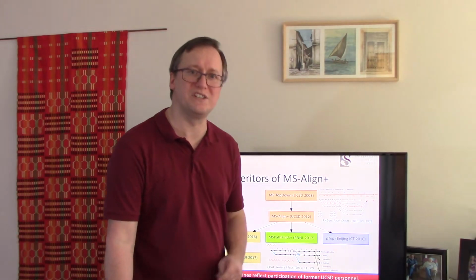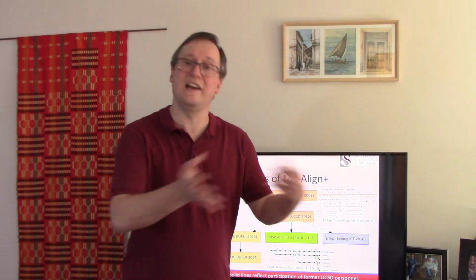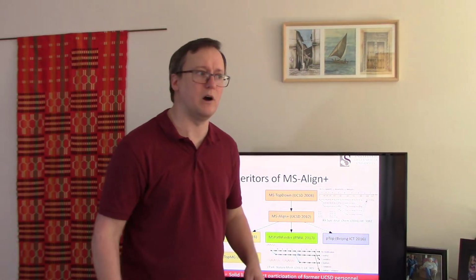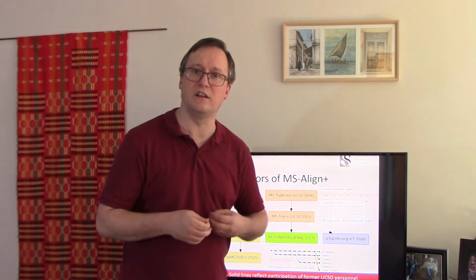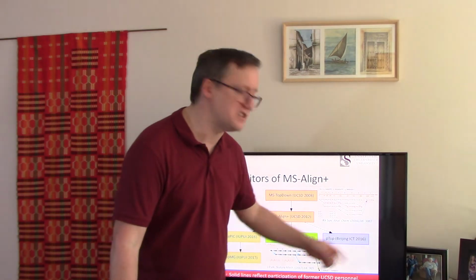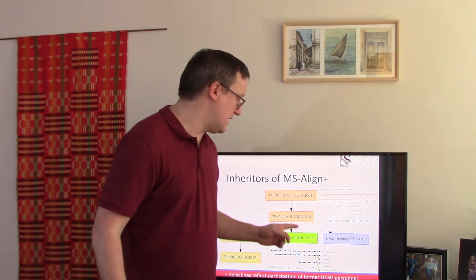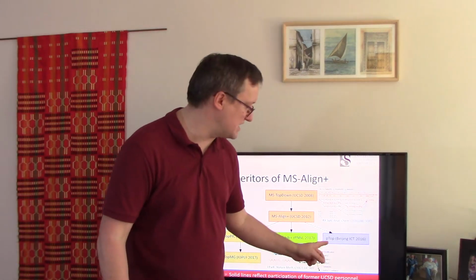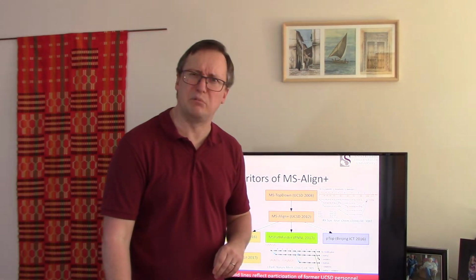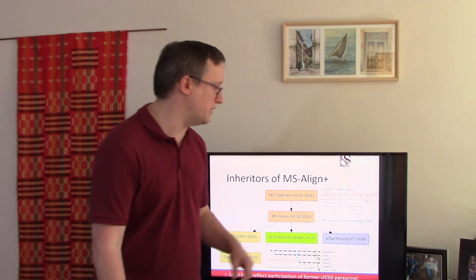This third link, however, is not an example of actual movement of people. It's a case where the idea has transitioned across the ocean. The folks who wrote pTOP are the same as the team that's behind the pFind algorithm that was created out at Beijing. So they're at the Institute for Computing Technology. It's a very mature suite of tools. pTOP is a relative latecomer. pTOP 1.0 was published in 2016. I believe they're on the verge of publishing version 2.0 now, which has added a lot of features on top of what was already there.